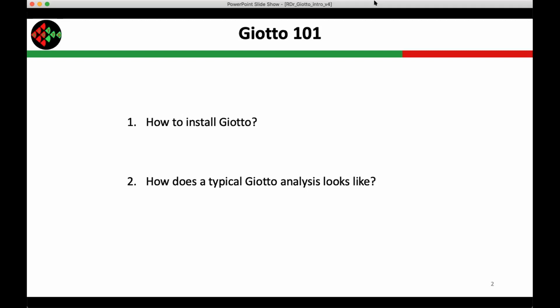Right. So I think each one of you probably has your favorite tissue and maybe also your favorite platform you want to use to generate some kind of spatial analysis data set, right? And what you all want to do is generate some kind of insight from the spatial data. To do that, what is really necessary with spatial information is that you also want to be able to visualize it, right? So we were thinking about how can we facilitate this for everyone and make it as easy as possible.